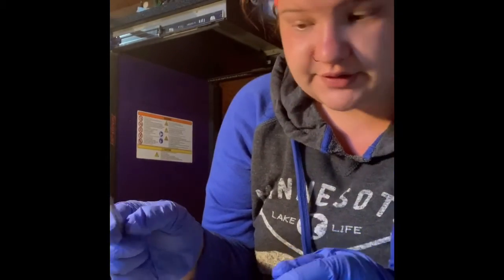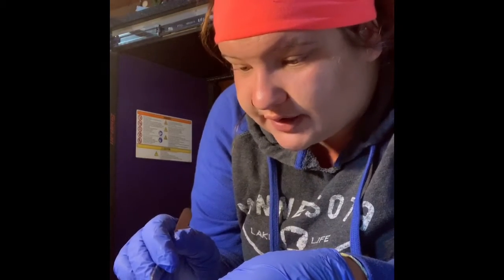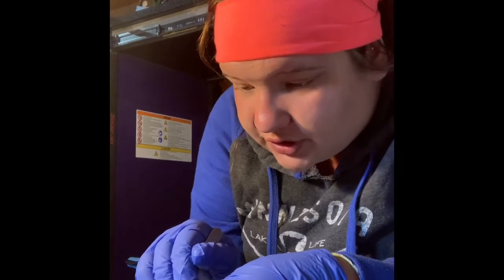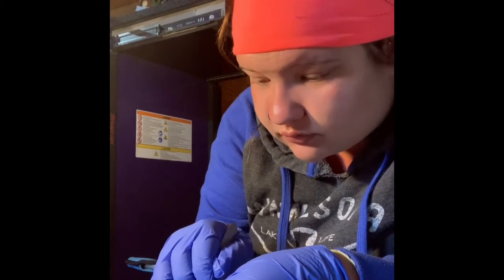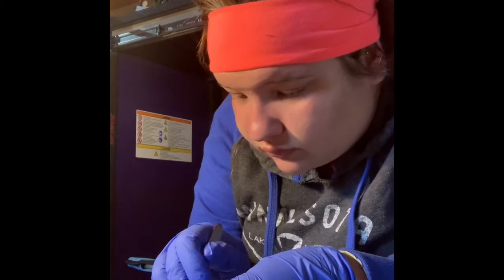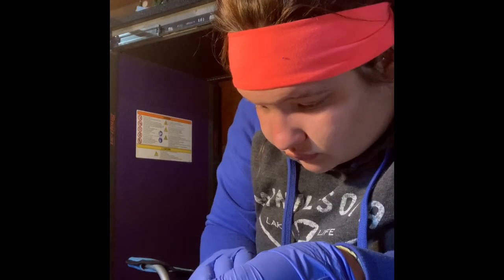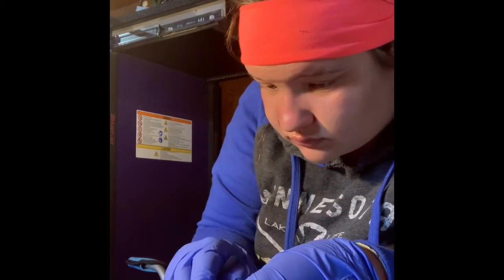Okay, see if I can see okay. So what I'm going to do now is take the sheep brain and make a mid-sagittal cut down the longitudinal fissure. All right, kind of show you what I've got here.